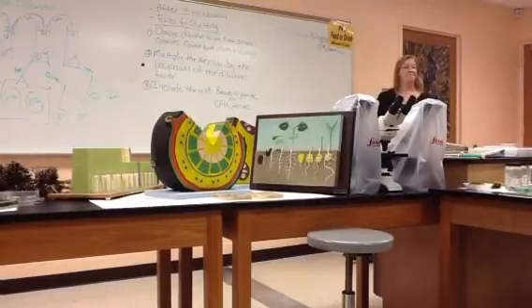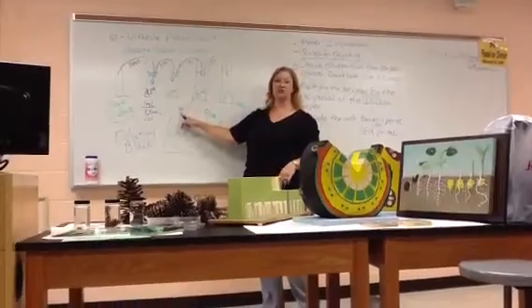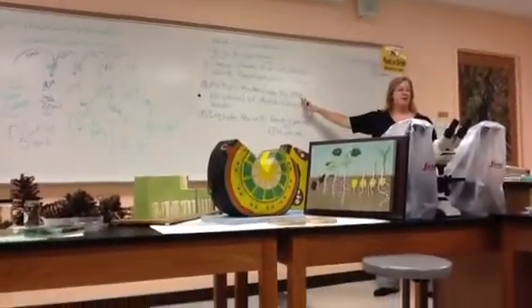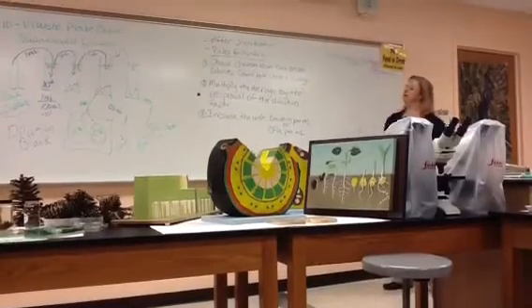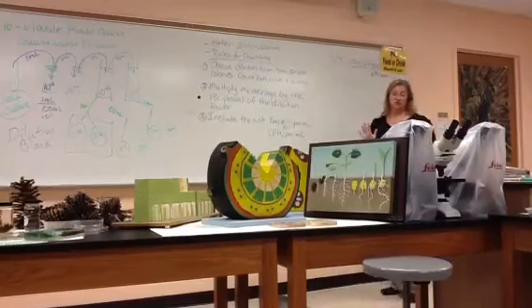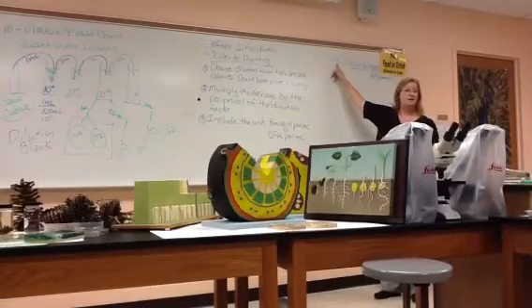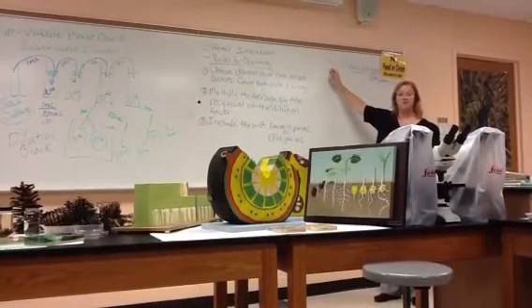You gotta follow that? Because you pipetted a ml of liquid from the 10 to the minus 6 dilution, there were 167 bacteria in that ml. So to work the math backwards, to figure out how many were in the stock culture, you're gonna take that average and multiply it by the reciprocal of the dilution factor. Sounds worse than it is. Dilution factor, that's 10 to the minus 6. If you had chosen the 10 to the minus 7 plate to count, it would have been 10 to the minus 7. It's whatever plate you counted.